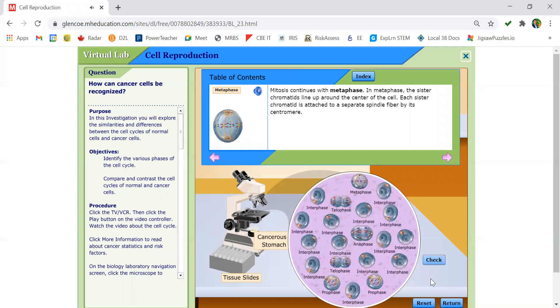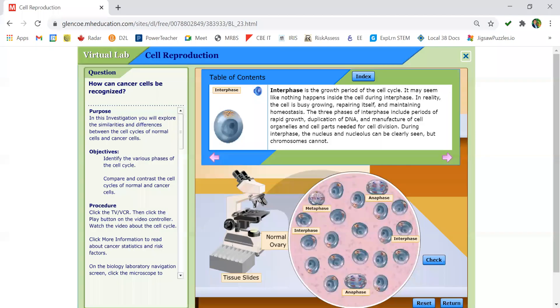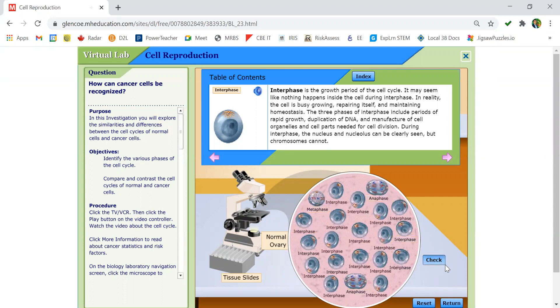Pause the video now to count the number of cells in interphase as well as the four stages of mitosis. Now we have a picture of normal ovary tissue. Most of the cells, as you can see, are in interphase. Pause the video now to count the number of cells in interphase as well as the number of cells in mitosis.